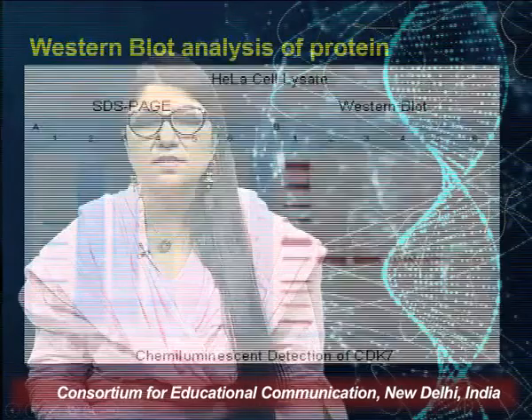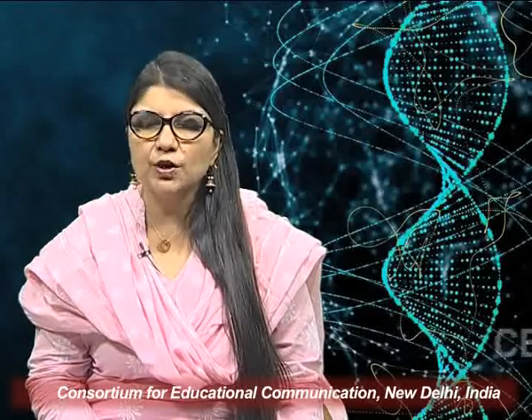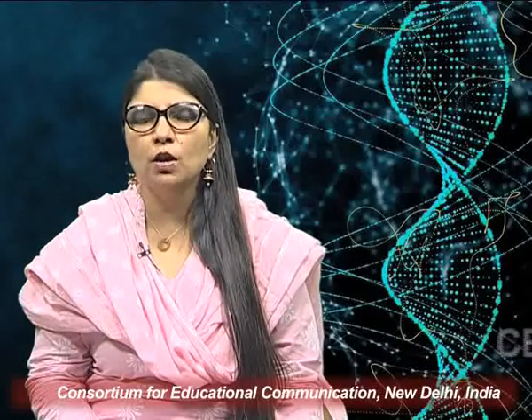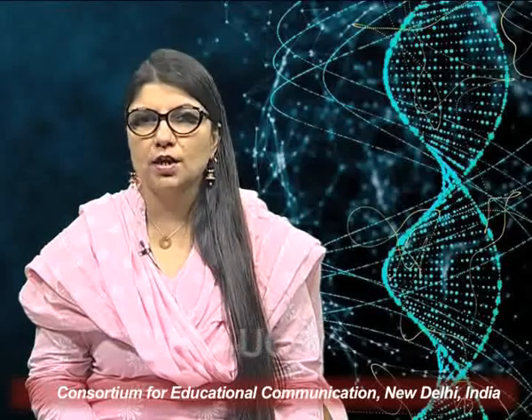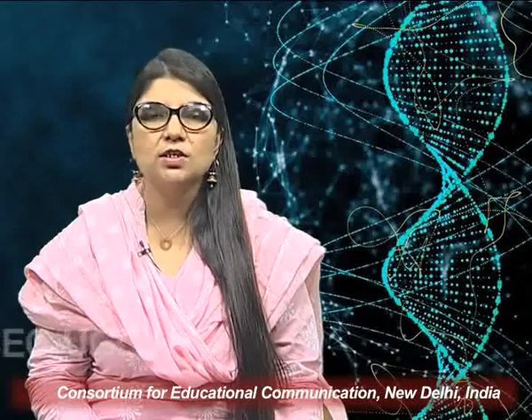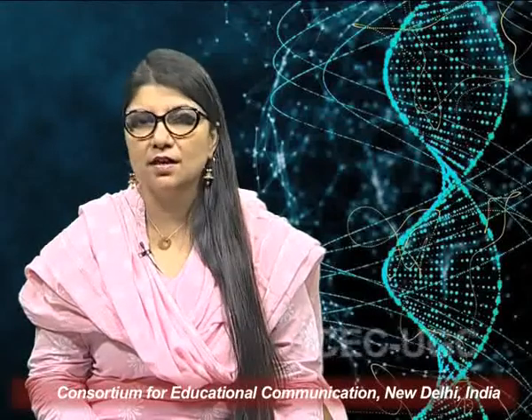So we have discussed the blotting techniques. The blotting technique is basically dealing with the transfer of the biomolecules onto inert supports, so that we can detect a particular fragment or a particular part of that biomolecule which is of our interest, what we want to manipulate, whether it is DNA, RNA, or protein. We want to carry out certain downstream applications. I will talk more about the applications of these techniques in our later sessions.